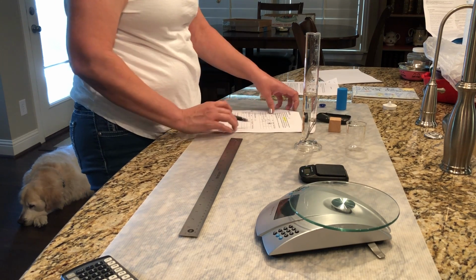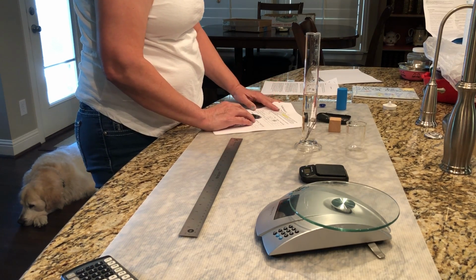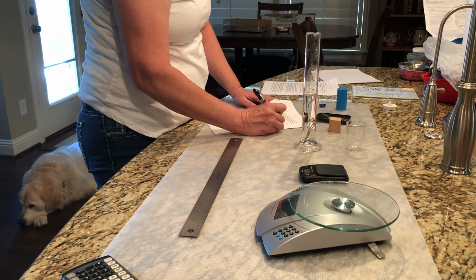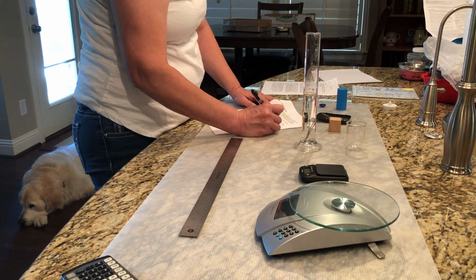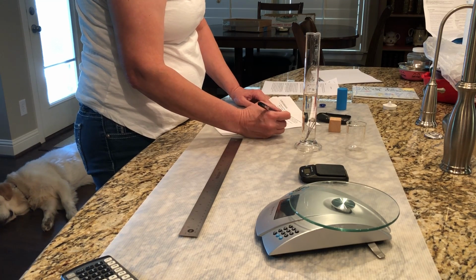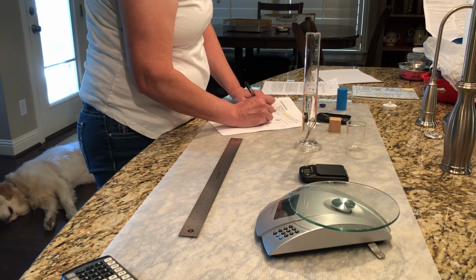Here, mass of the nail cutter is going to be the 0.151 minus 0.135. So the mass of the nail cutter is 0.016.